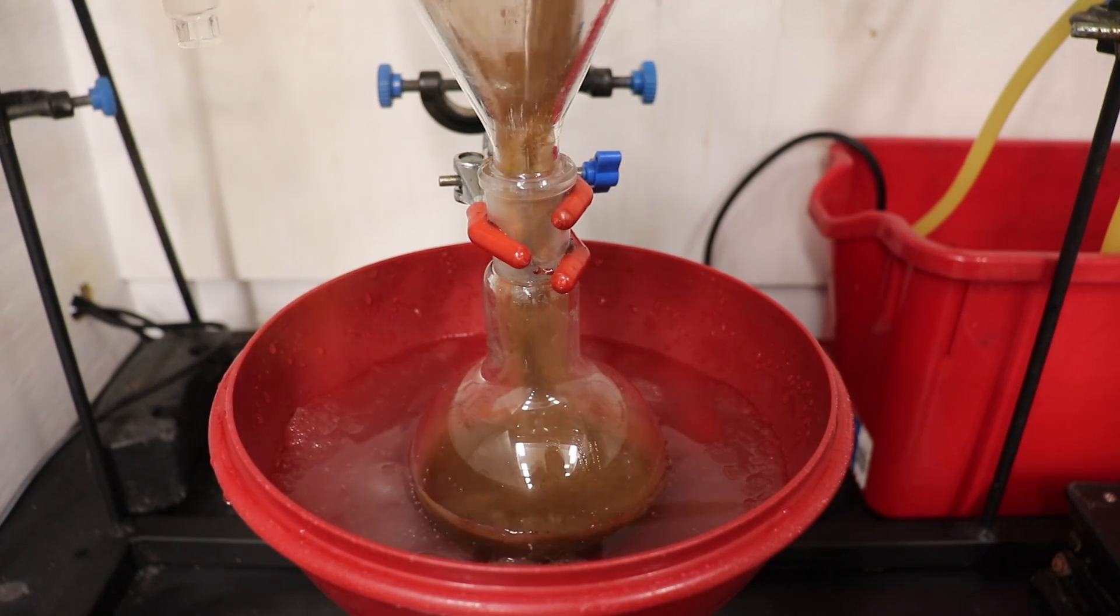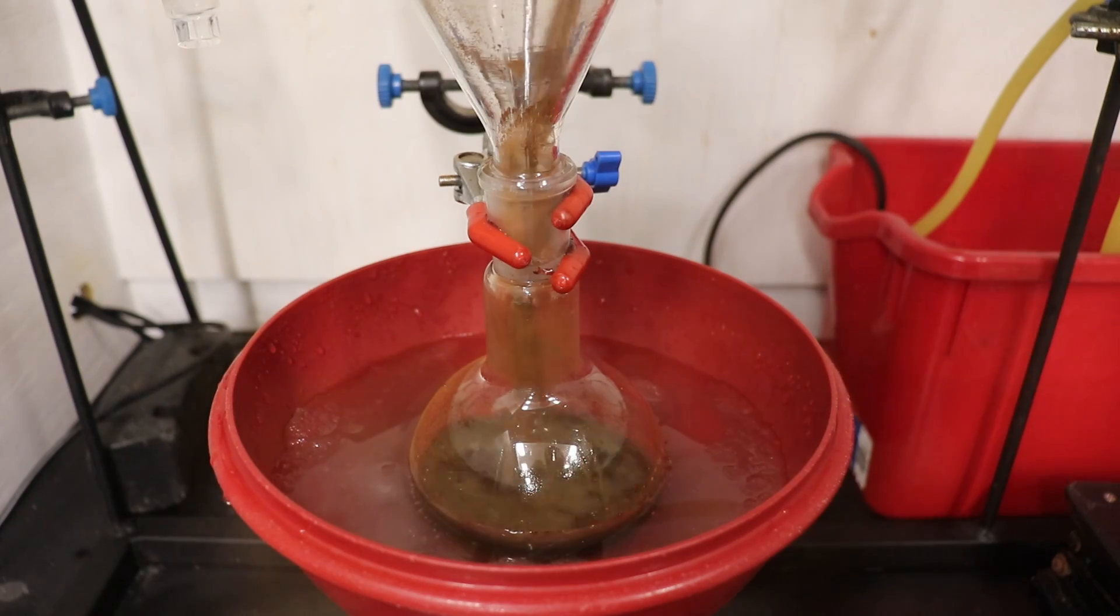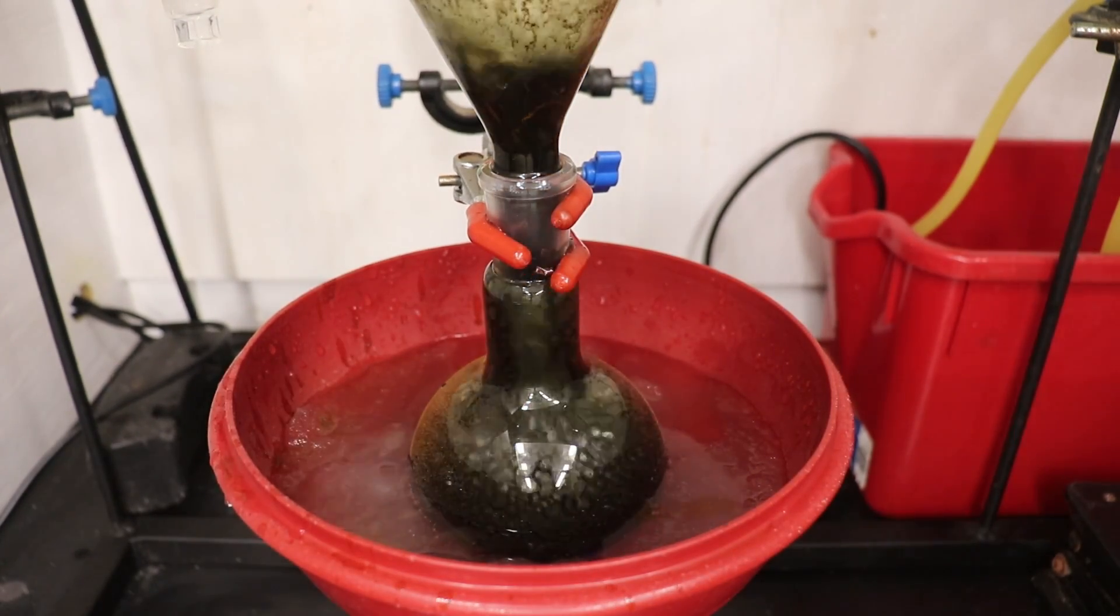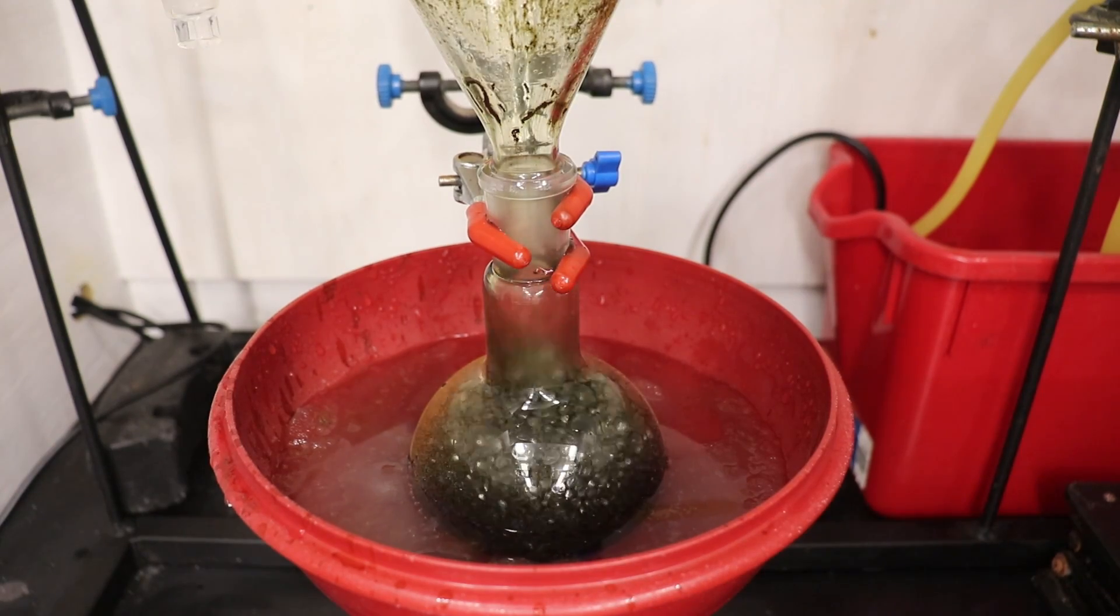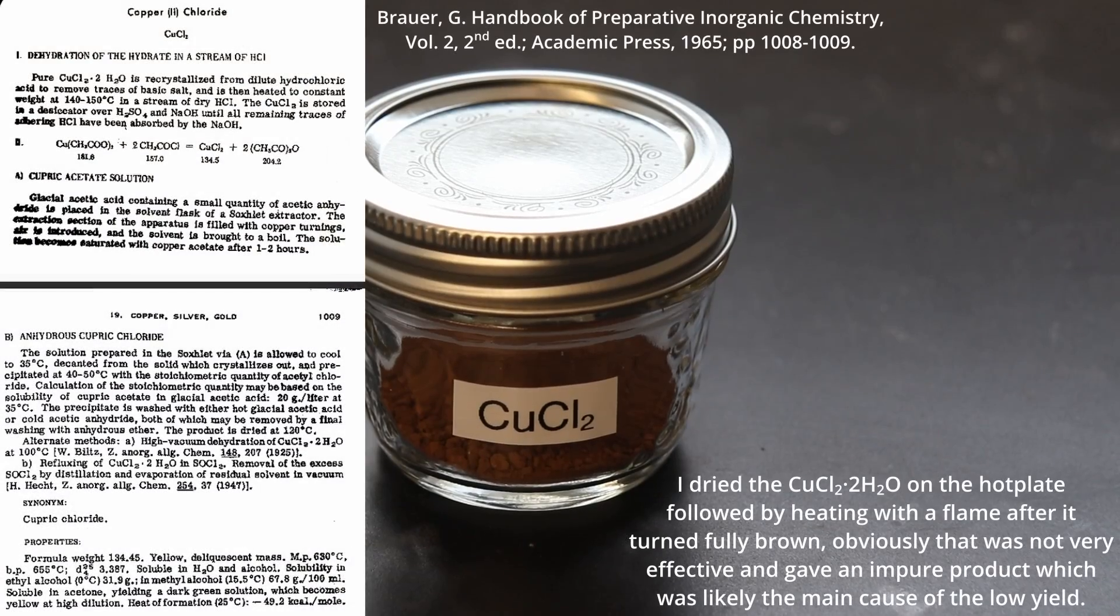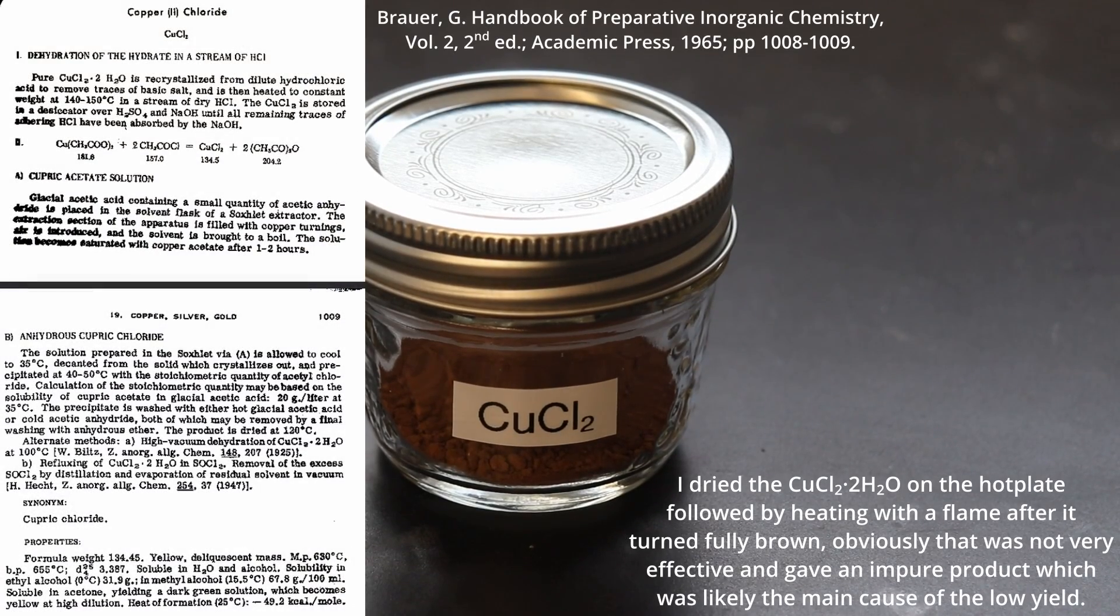Now we can look at the most obvious mistake, which was the rapid addition of the copper chloride leading to the exotherm that splashed some of our product out of the flask. However, it seemed that only a few mils of the solution escaped, so this should only be a single digit loss of yield at most.